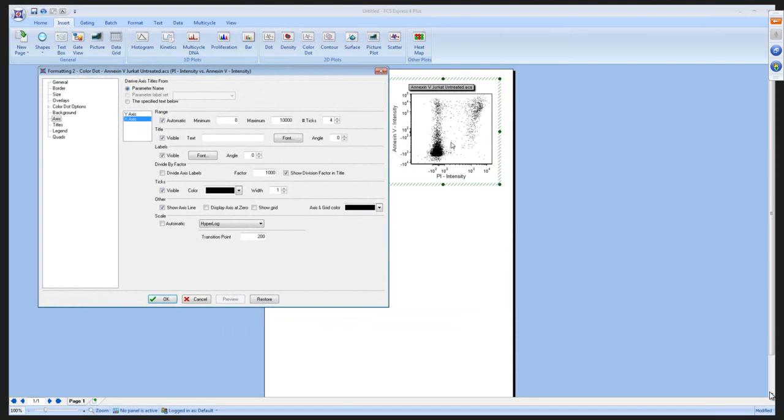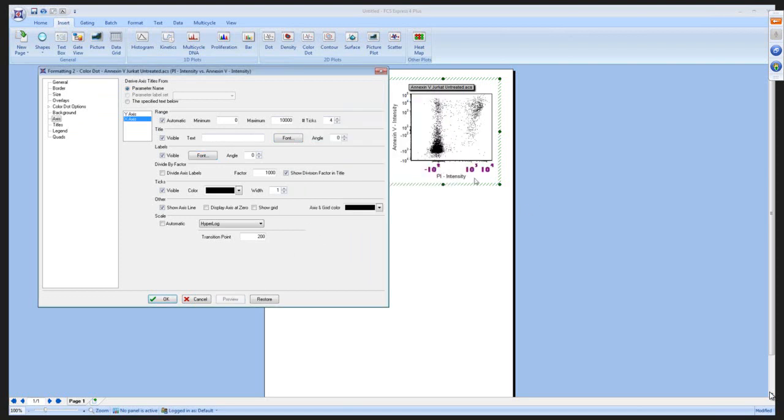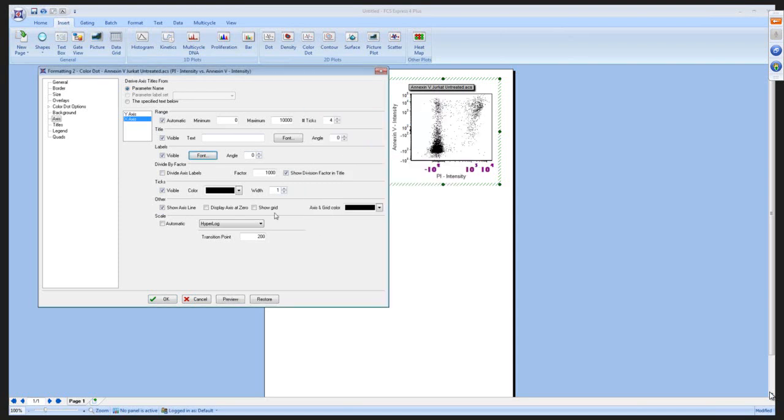But again, if you want to make any changes to these plots, maybe we want to change the labels here, if we want to make the fonts a different size or a different color, we'll do this. And you can see that our titles for the ticks have changed. Now this may seem very simple, but what have you had to do in the past? To make these formatting changes, what you've probably had to do is export these things to PowerPoint, put a little text box over something to white out the area, and then you're off to publishing from that point.